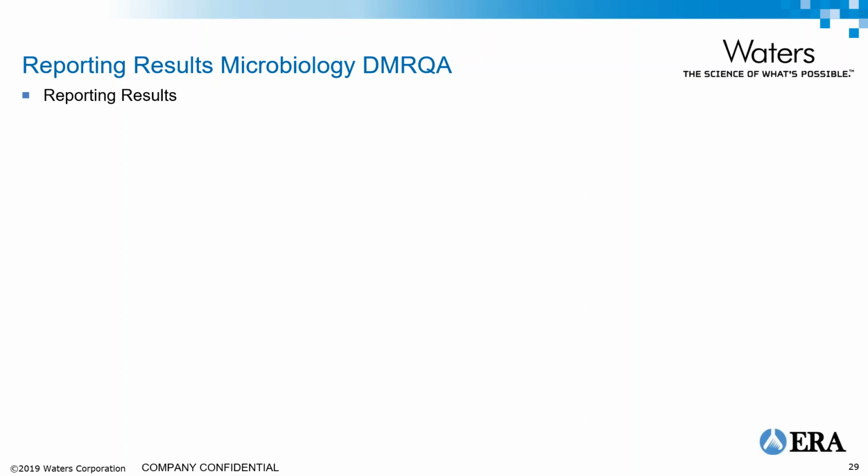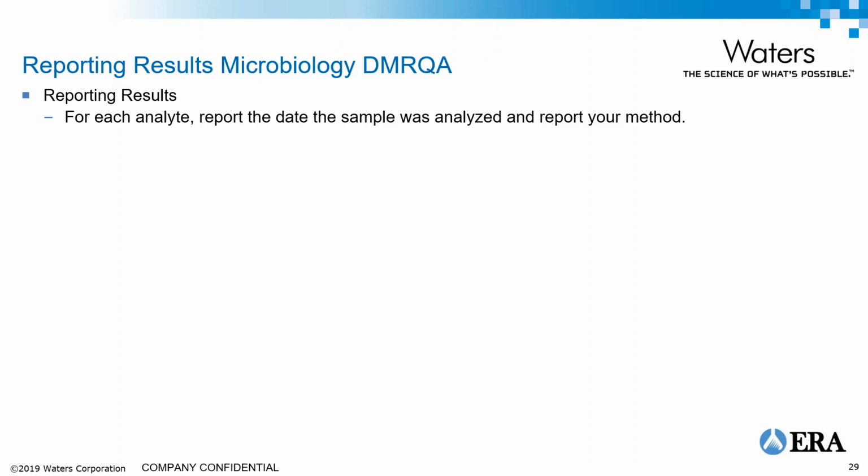All right, so for analytes, report the date the sample was analyzed and report your method. If you don't do that, we're still going to evaluate your results, but it may come back to you when you report the information off to your accrediting body. They want to see when was it done, what was the method.